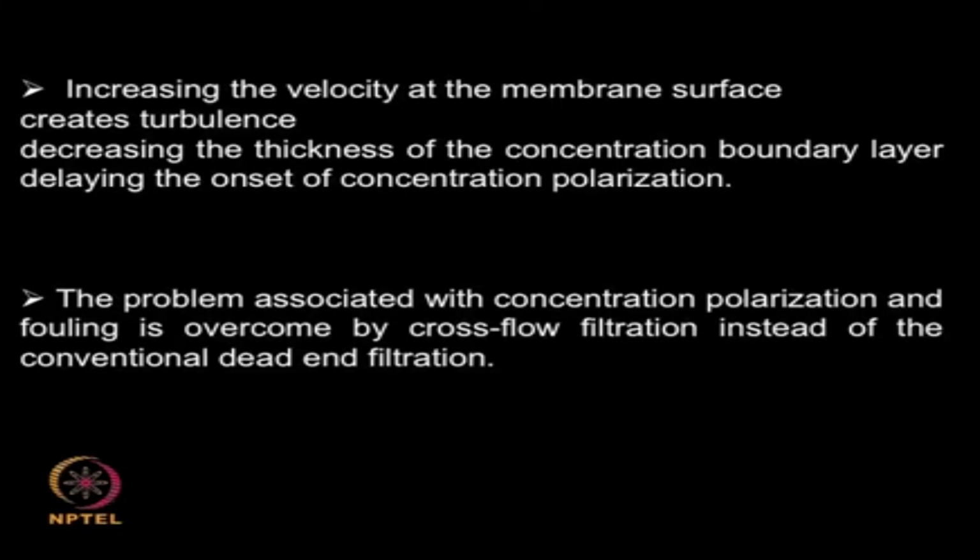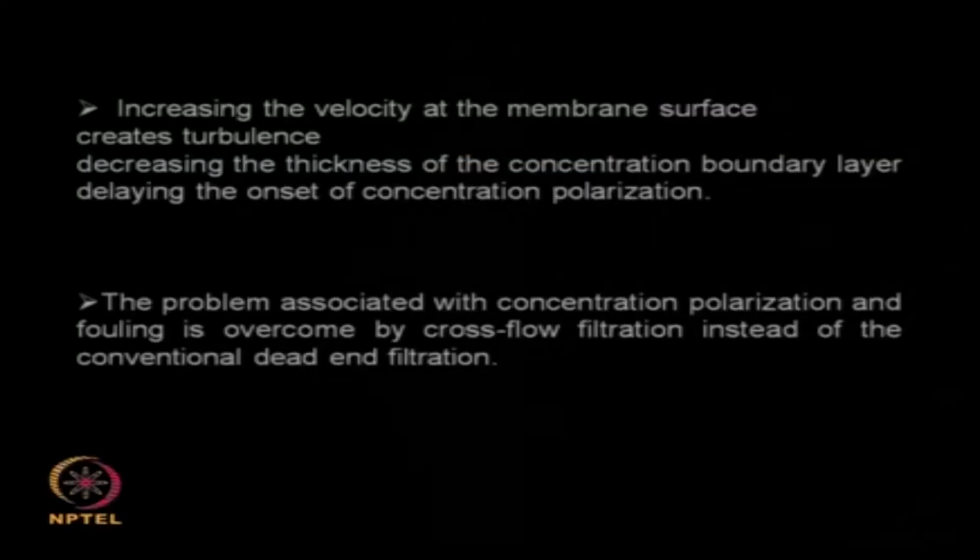Another way by which you can reduce the concentration polarization is using a cross flow filtration. So far what we saw is a perpendicular flow, that means the flow is perpendicular to the membrane surface, or the membrane surface is perpendicular to the flow direction, okay, and it is also called dead end filtration. So normal filtration is also called dead end or perpendicular filtration.